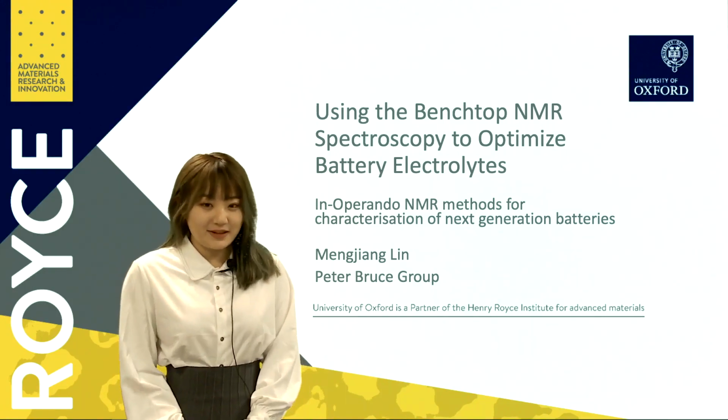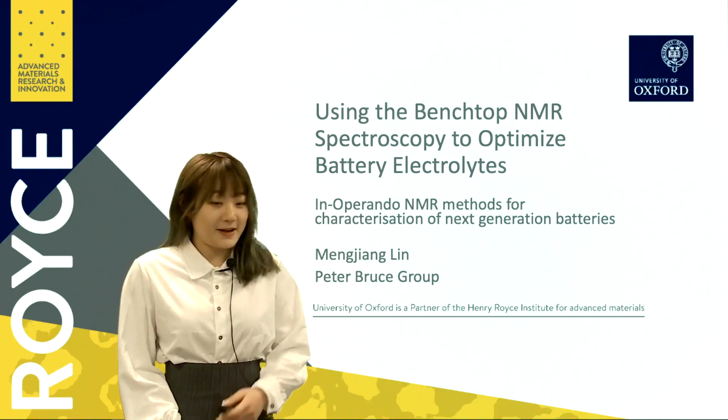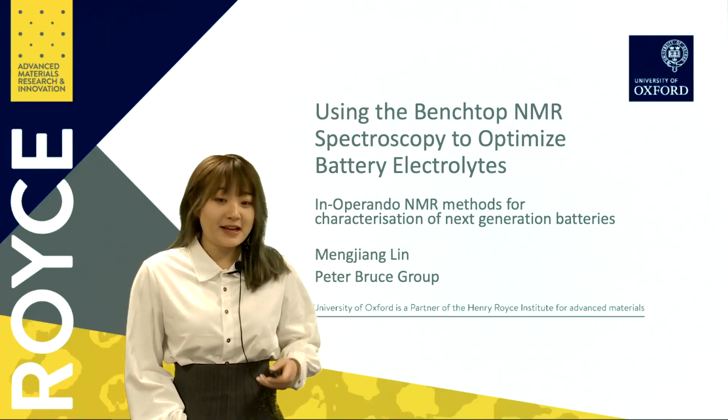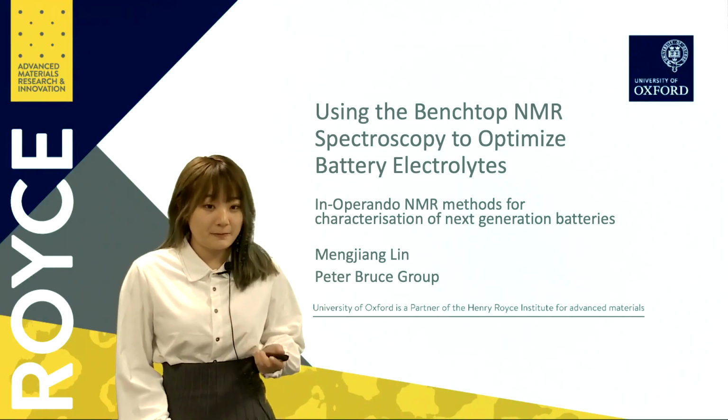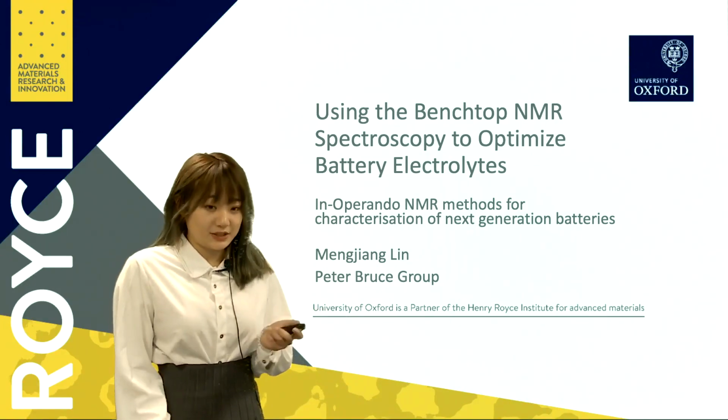So today I want to give a quick research talk about my current research project, that is to use benchtop nuclear magnetic resonance spectroscopy to optimize battery electrolytes.